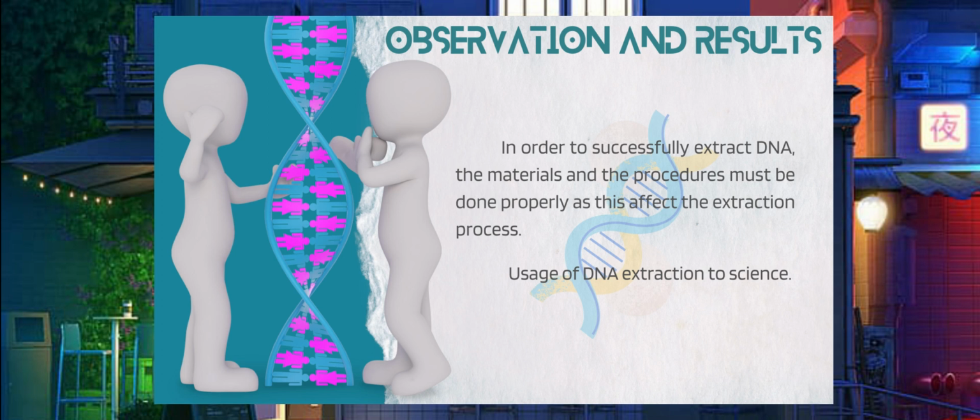The alcohol used must also be a 70% solution and must be chilled. It is better to chill it overnight before the experiment, as this helps in increasing the yield of the DNA. The cold alcohol protects the DNA by slowing down the enzymes that can break it apart. It can also precipitate the DNA so that it appears quickly and solid.